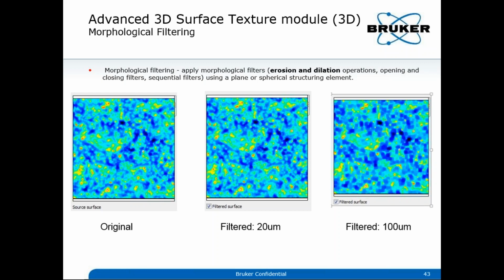They may upgrade their old system to a 3D, non-contact optical method, but they will need this software to do the comparison between before and after. So using 2D and 3D, you have to do a correlation and simulate the 3D data if they are using a 2D method to do it.